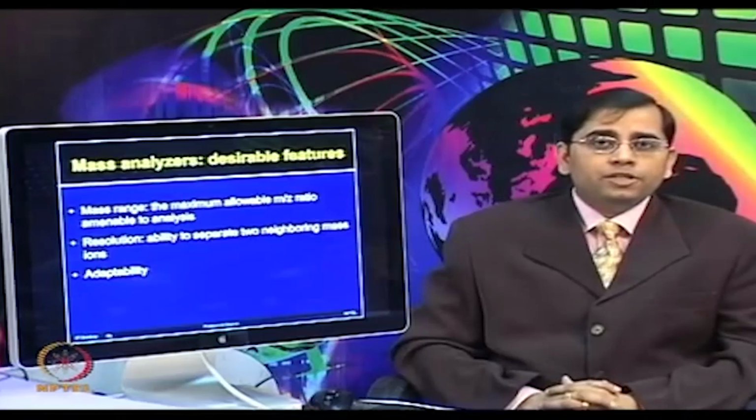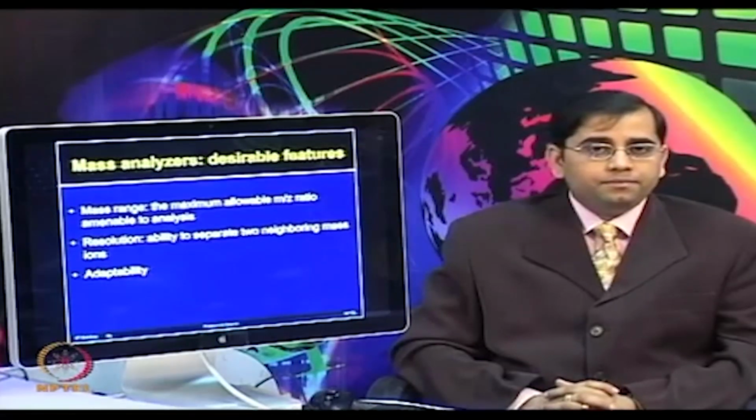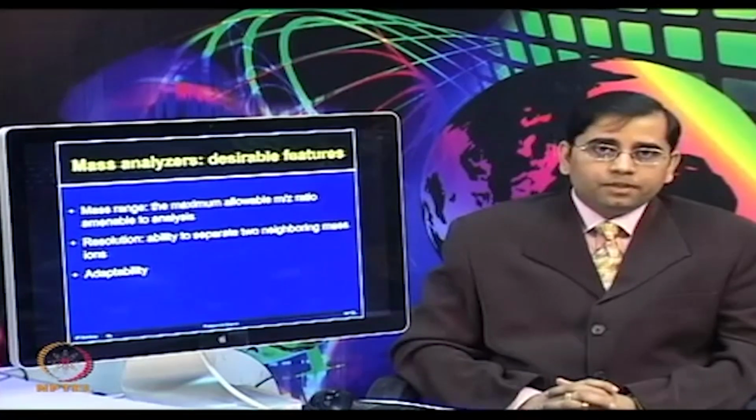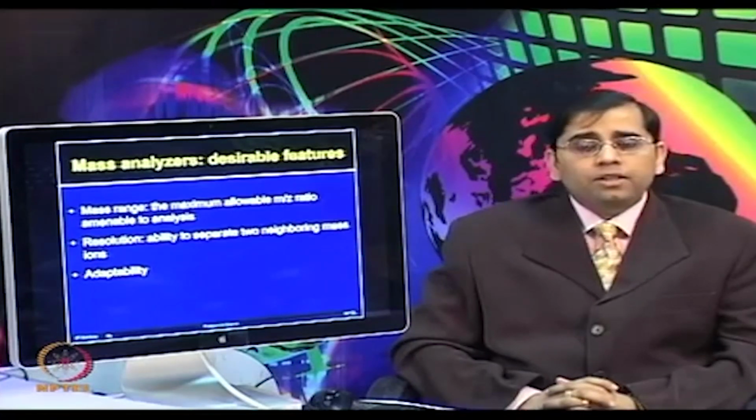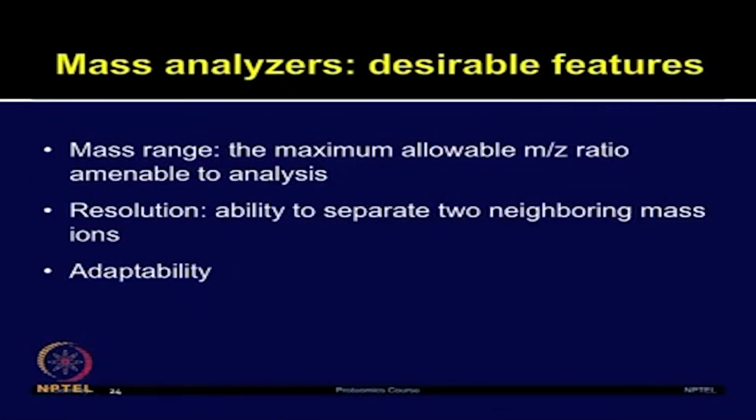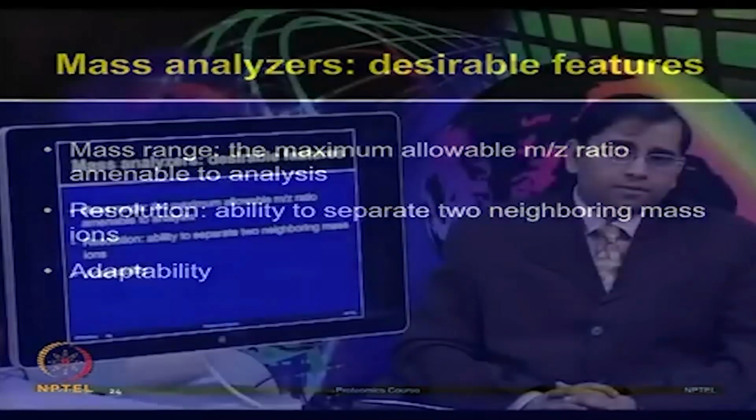What are the desirable features of a mass analyzer? The performance of mass analyzers can be evaluated on the basis of various desirable characteristics. Mass range, which is the maximum allowable m/z ratio amenable to the analysis.